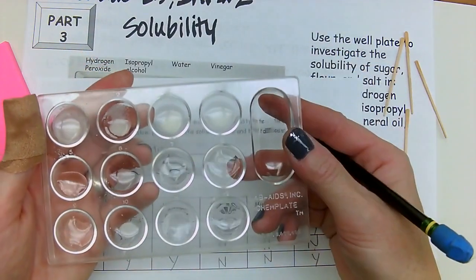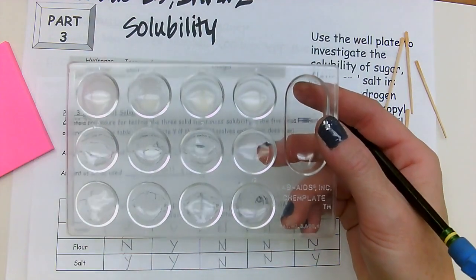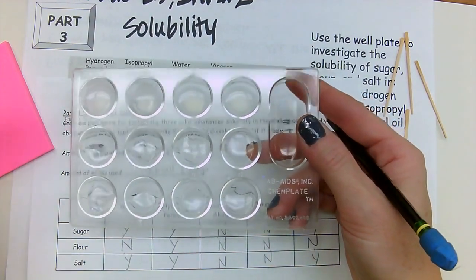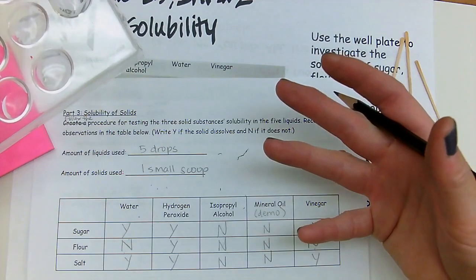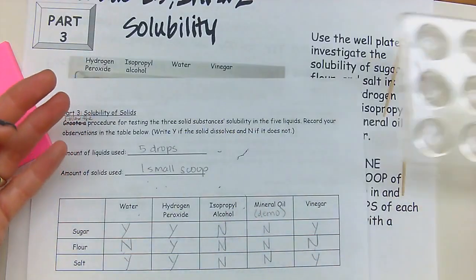Okay, so what you're going to do now with this plate is you're going to bring it over to the sink. It gets rinsed out, and then everything gets set back up into your tray. And if you have differing results, that is fine as long as you have evidence for that, okay?